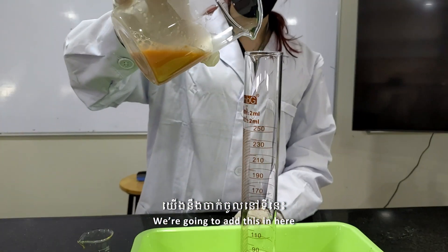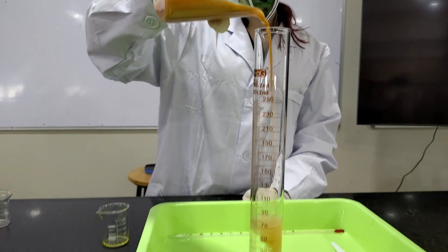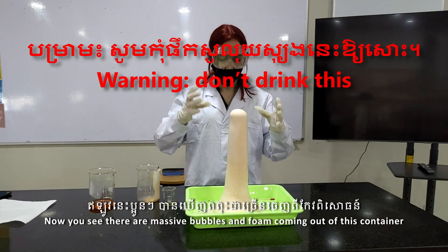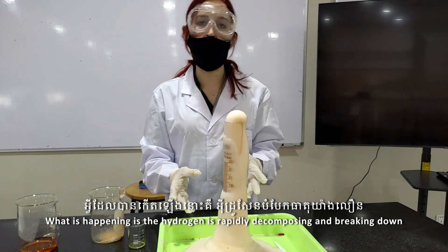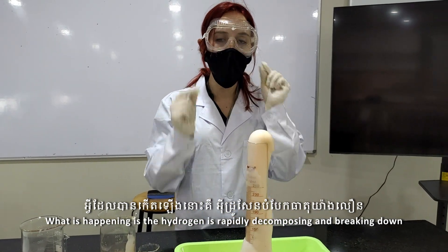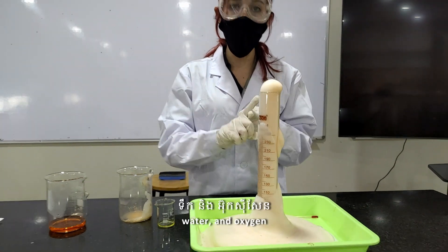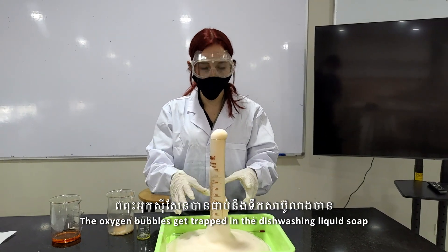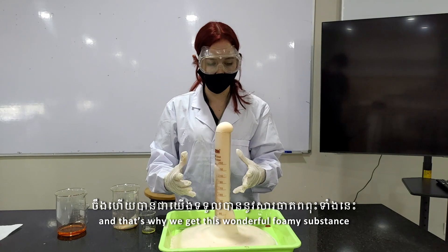We're going to add this in here — you tell me if you think this looks like elephant toothpaste! Now you see there are massive bubbles and foam coming out of this container. What is happening is the hydrogen peroxide is rapidly decomposing, meaning it's breaking down. As it breaks down it releases two things: water and oxygen. The oxygen bubbles get trapped in the dishwashing liquid soap, and that's why we get this wonderful foamy substance.